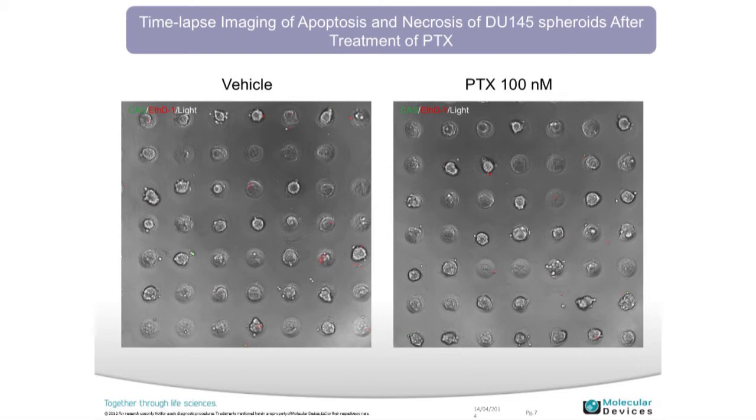This is the color merge movie of three different stains. Green represents viable cells and red represents necrotic cells. When you compare them in time lapse, you get a lot more information from the same cells by monitoring them over time.